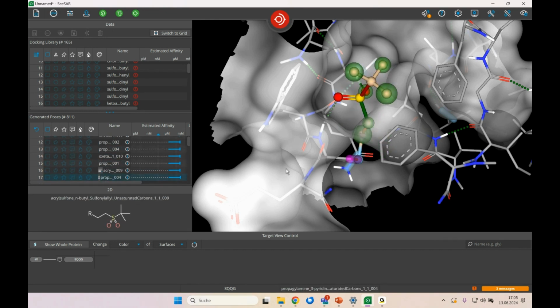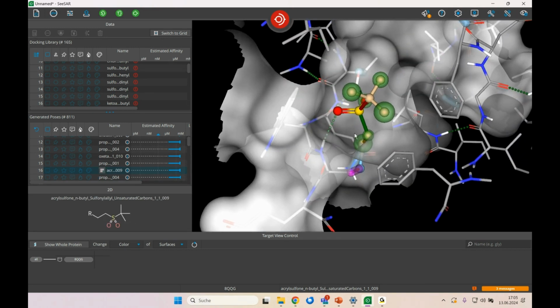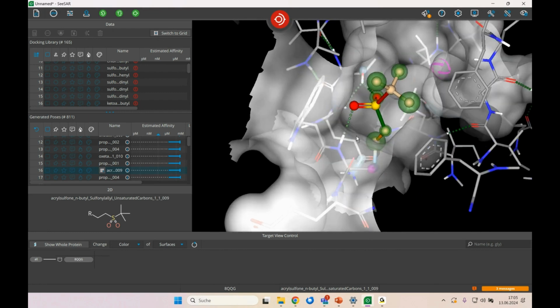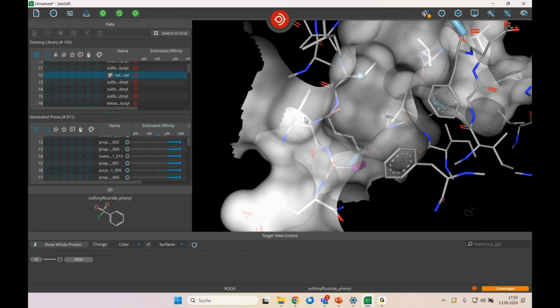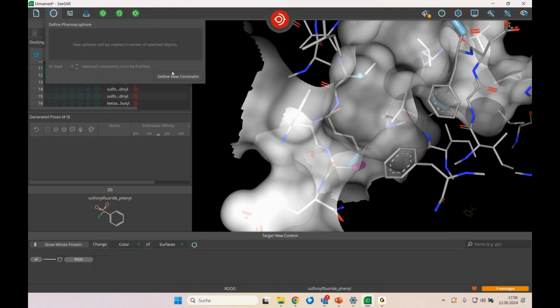What is also possible to do is apply pharmacophore constraints for the unbound, untransformed compounds to see what could actually match there. You can also quickly do this as a last feature. What I mean is you can apply a pharmacophore constraint in proximity of the cysteine. Let's be a bit more generous, maybe 3.5 angstrom, and we would like to have the covalent warhead placed in the proximity there.